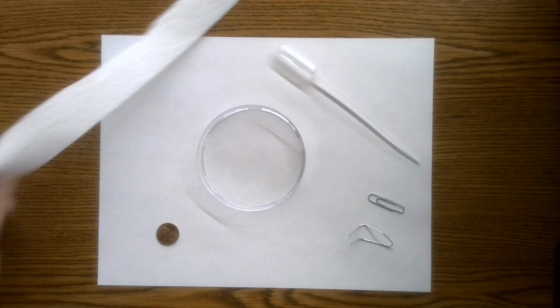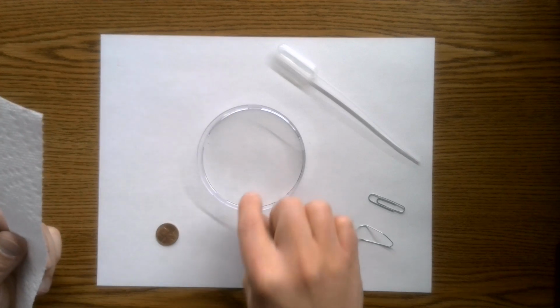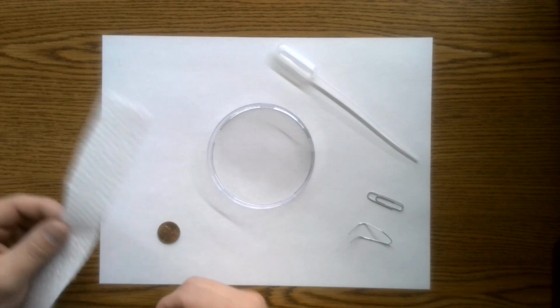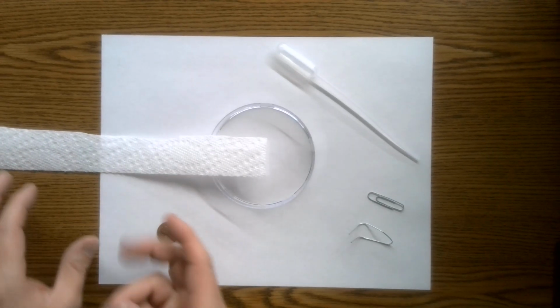Alright. The first part is you're going to take a piece of paper towel, it's about 2 inches wide. You're going to have a petri dish that's going to be halfway filled with water, so go get some water. There'll be a beaker of water, or you can fill it up with the sink. Alright, and you're going to submerge one end in, and you're going to watch what happens.